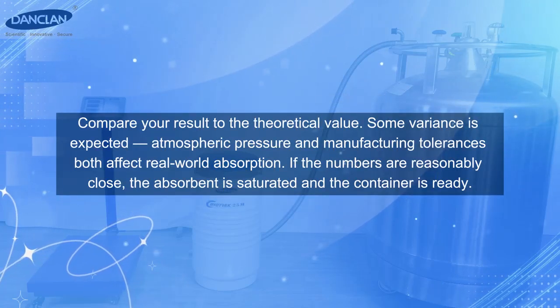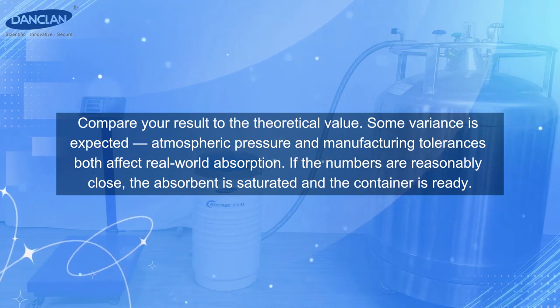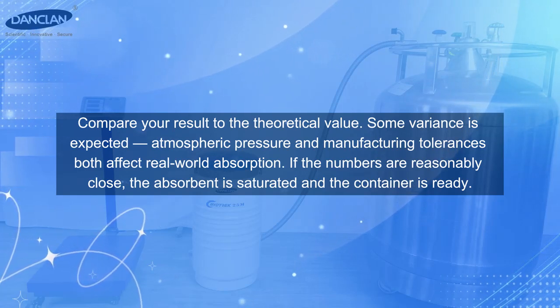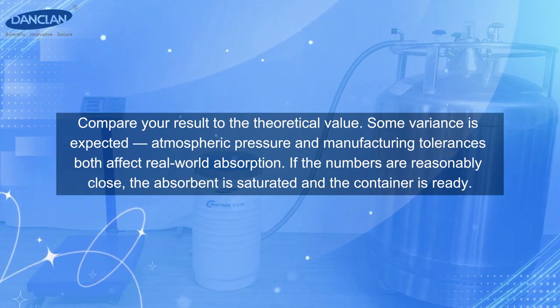Compare your result to the theoretical value. Some variance is expected. Atmospheric pressure and manufacturing tolerances both affect real-world absorption. If the numbers are reasonably close, the absorbent is saturated and the container is ready.